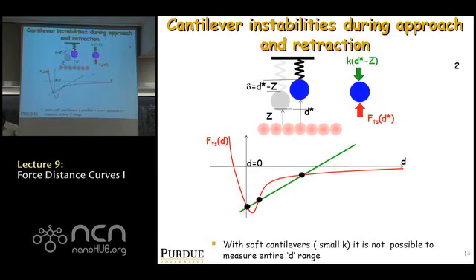And as you come closer to the sample, what happens is, this is your tip sample gap, but at a certain point you reach a point where if you move the Z a little closer, the tip sample gap suddenly changes from being here to being somewhere there. You see that? Let me go back up. You're out here. Coming closer is simply moving the origin of this green curve further to the left. So as I come a little closer, suddenly the tip sample gap from being here jumps to being here because that's the only possible intersection of these 2 curves.